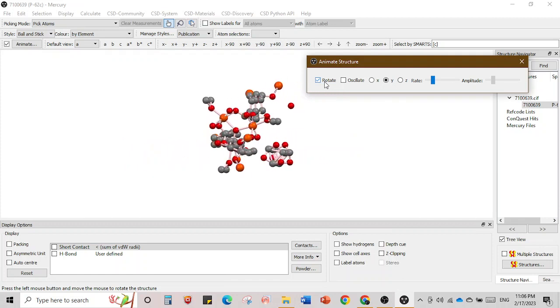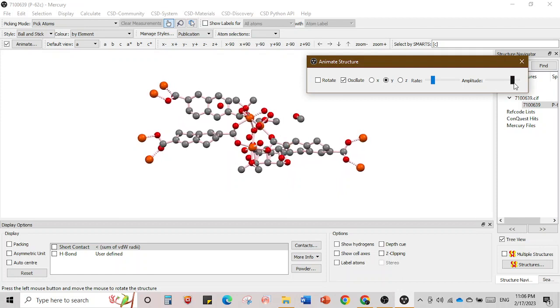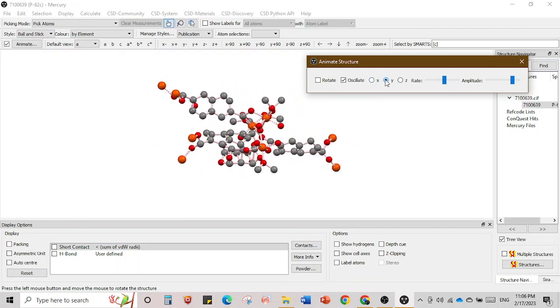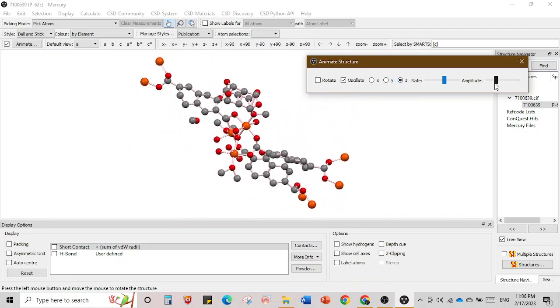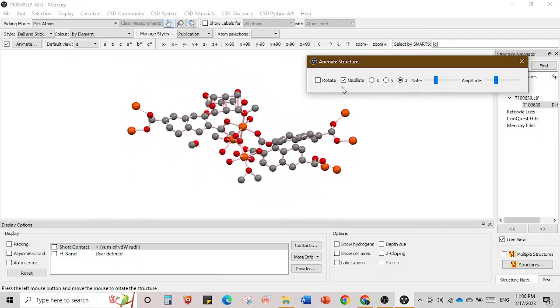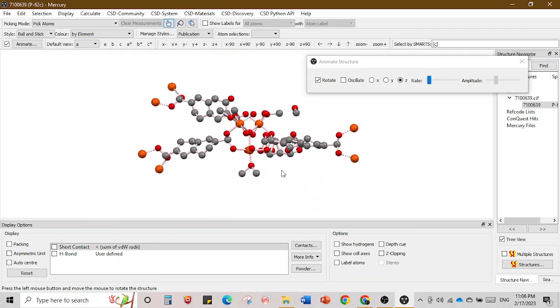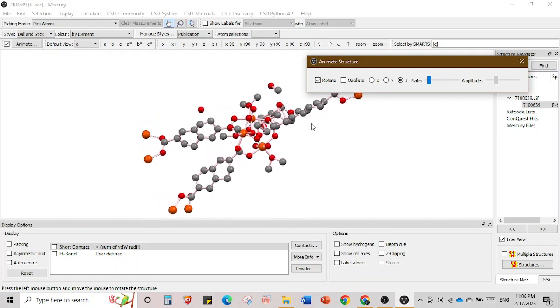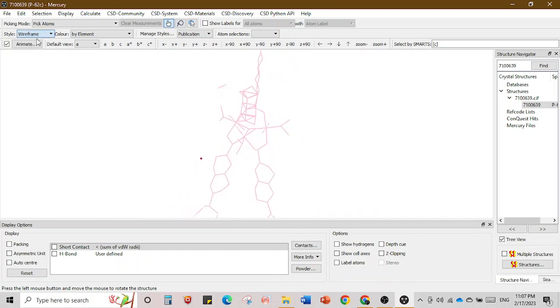You can also give oscillation — control how big the amplitude should be or how fast it rotates along the y, x, or z axis. You can play around with this. From the display options you can switch to Wire and Frame, or Capped structure, or Ball and Stick which is the usual structure, or Space Filling which shows electron density, or Ellipsoidal structure, or Polyhedra where metals are shown in polyhedral form.